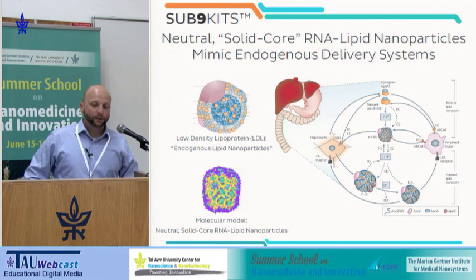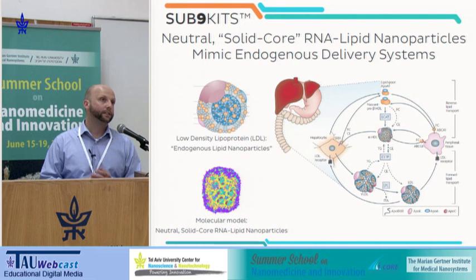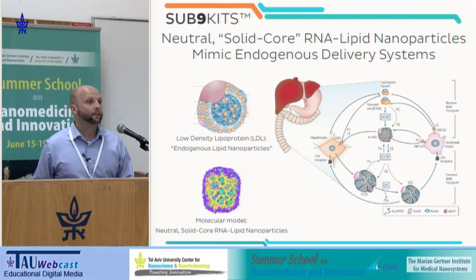The LNPs that we make in the Sub9 kits, and what you'll make tomorrow, are what we call solid core RNA lipid nanoparticle systems. And they really are very effective delivery systems. This is similar to technology that's being brought towards the clinic by a few different oligonucleotide drug companies. And with this, we're really mimicking your natural endogenous lipid nanoparticle systems in your body. So when you go to your doctor and they talk about good and bad cholesterol, your LDL and HDL particles, those are nanoparticle systems, as I'm sure many of you know, that are used in your body to deliver cholesterol and other molecules throughout cells in your body.